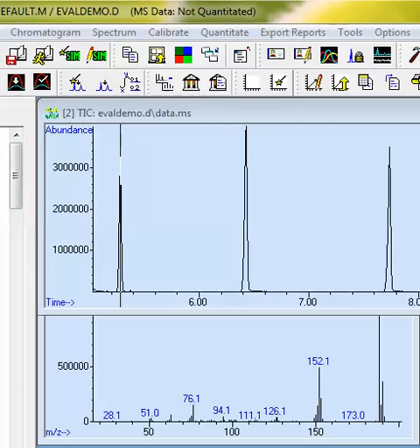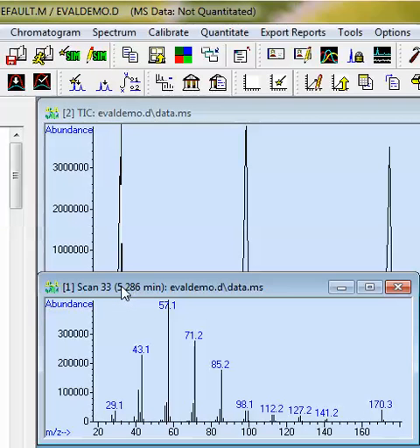The integration in GCMS analysis is usually performed for specific ions. In our case, we figure out what the spectra are for individual peaks. We'll find out that the first peak has most abundant ion 57. However, that ion can be part of many other spectra and so might have too much noise. 170 is the molecular ion, but it's very low, so maybe we'll go with a compromise of 85 or 71 ion.